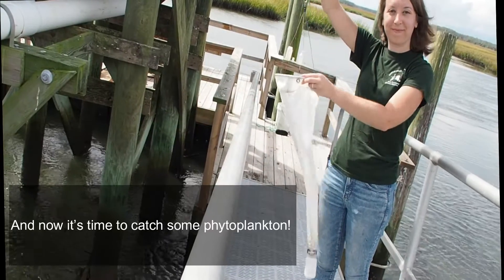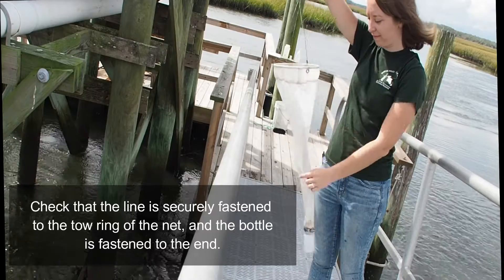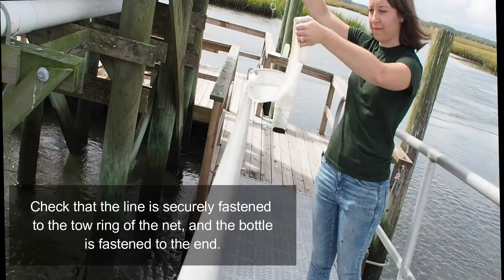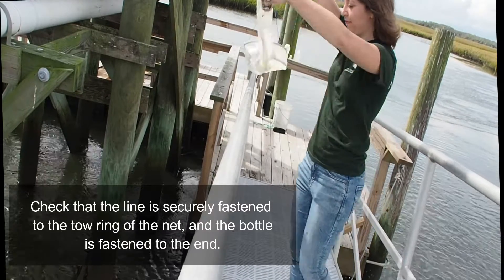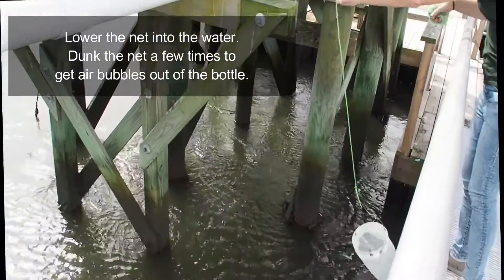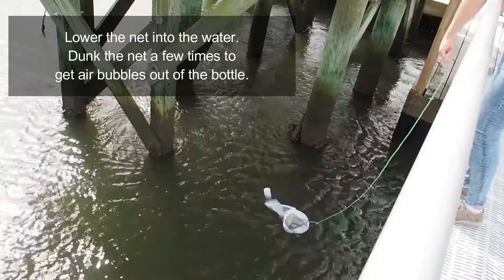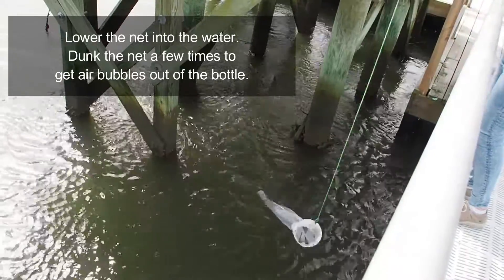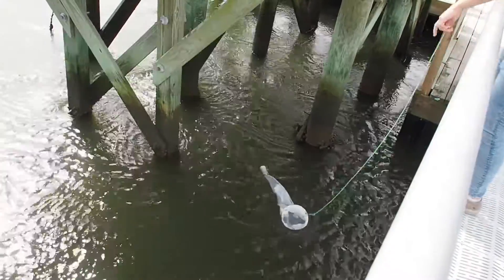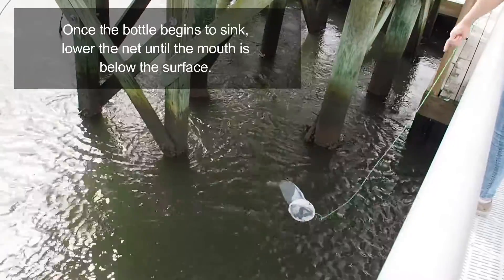Now it's time to catch some phytoplankton. Check that the line is securely fastened to the tow ring of the net and the bottle is fastened to the end. Lower the net into the water and dunk it a few times to get air bubbles out of the bottle. Once the bottle begins to sink, lower the net until the mouth is below the surface.